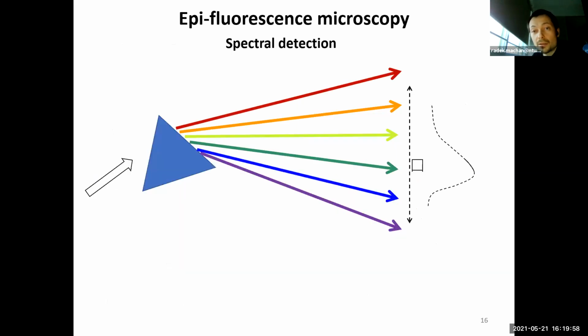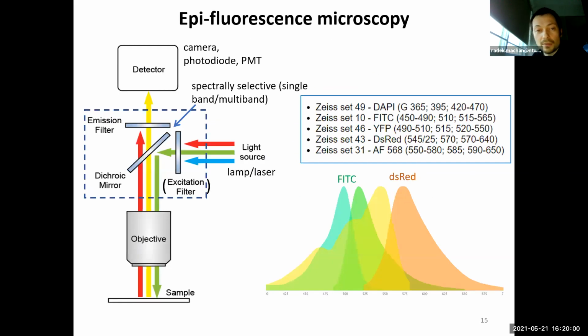One more thing. Traditionally, the emission filter, excitation filter and dichroic mirror come mounted in one holder, a sort of filter cube, but sometimes at some microscopes there are separate turrets for excitation filters, for emission filters, and for dichroics.